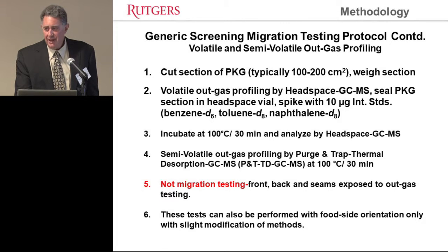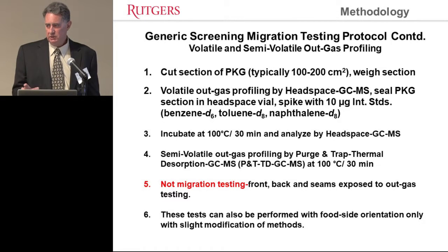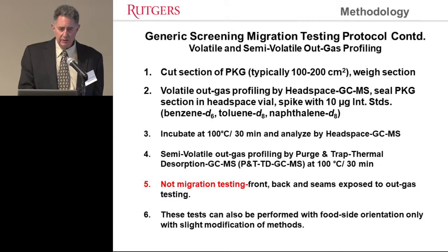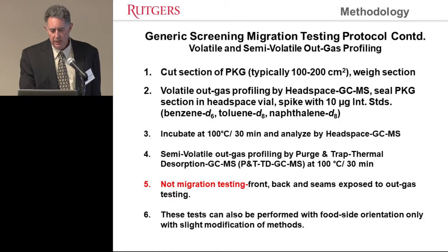And then we also do LCMS on the samples. GCMS is good for volatiles, but LCMS is optimized for non-volatile compounds, things that might have more aqueous solubility. We go for 100 times concentration, just like GCMS, and we do it by evaporative concentration, usually in a rotary evaporator, and then redissolve the samples in mobile phase buffers compatible with HPLC. It's usually water and acetonitrile or 100% acetonitrile with 0.1% formic acid in it. Then we do LCMS analysis in both positive and negative ion mode, because certain compounds are much better in positive ion than negative ion, so the data is combined and interpreted.